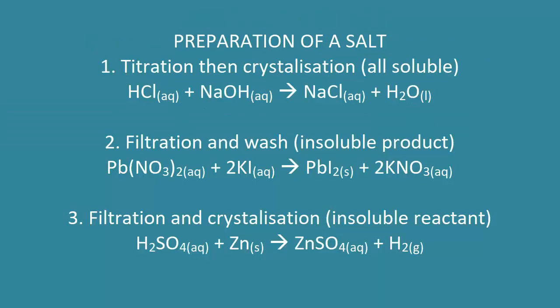And that's how you make all three salts, depending on whether the product is insoluble, the reactant is insoluble, or whether they're both soluble, using a combination of titrations, crystallizations, filtrations and washes.